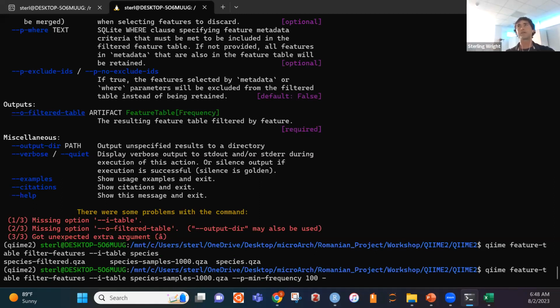People sometimes drop that threshold to 10. Some people drop it to even 2. I generally like to have at least 100.